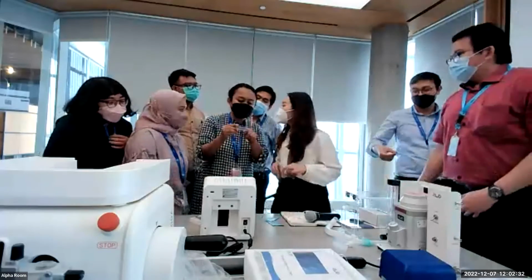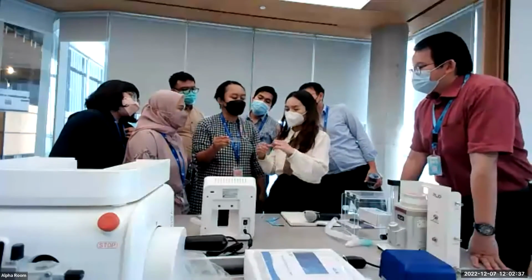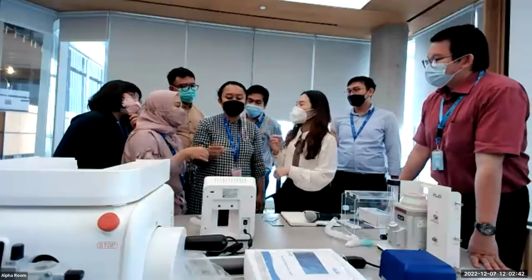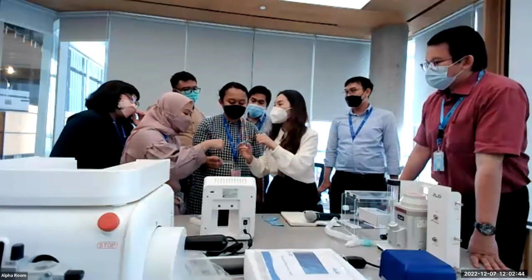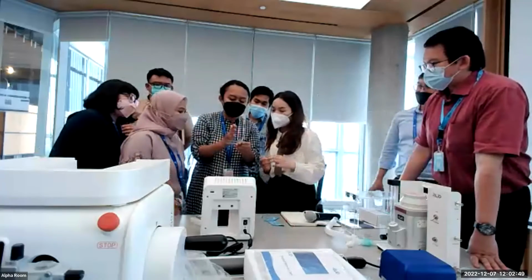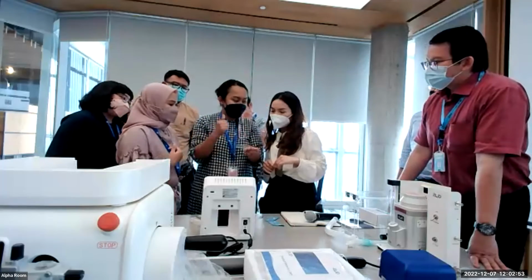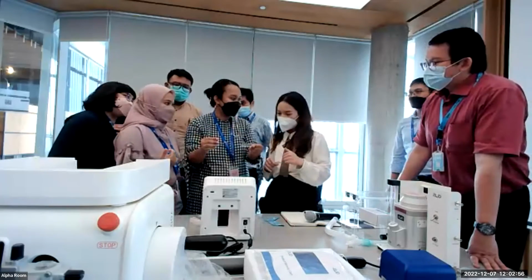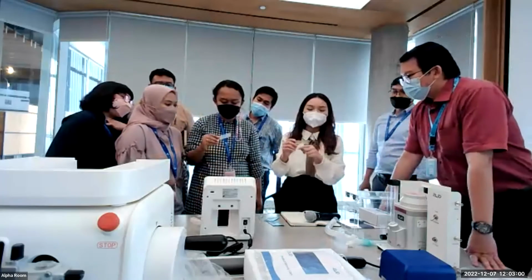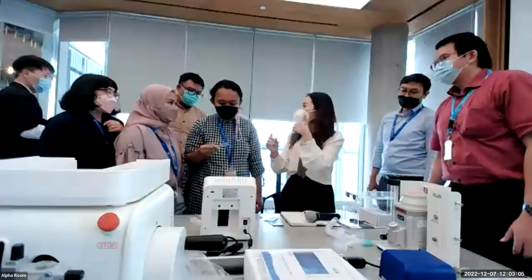If we just fill the A1, the A part is okay or not? It's okay. But the B side we still reuse. So if we just use this one, and then the next day I want to use this one, the B can with different cell. Yeah, but for other brands, they maybe only 1 chamber, so just one use once.